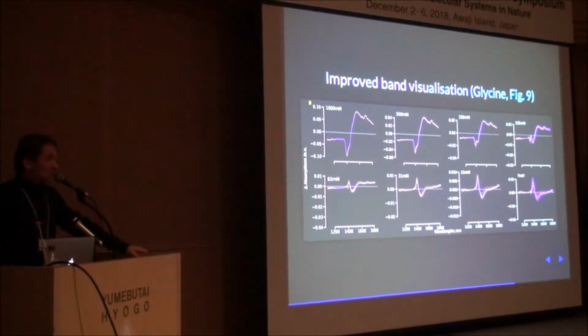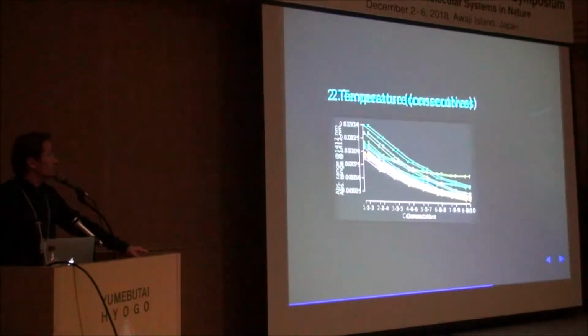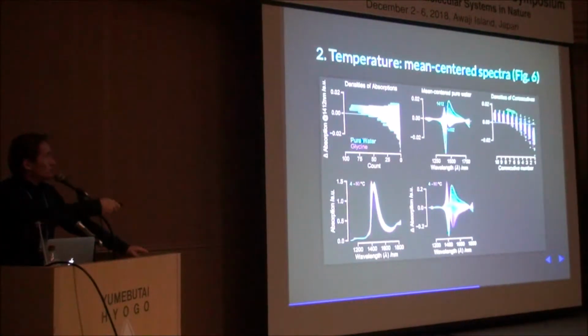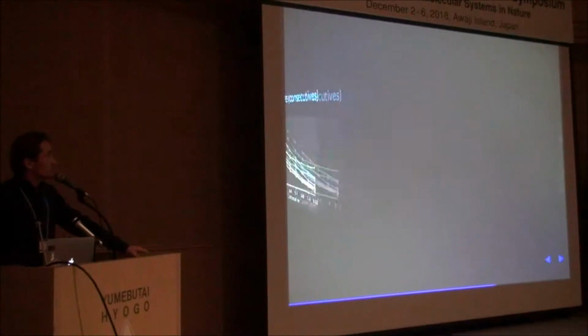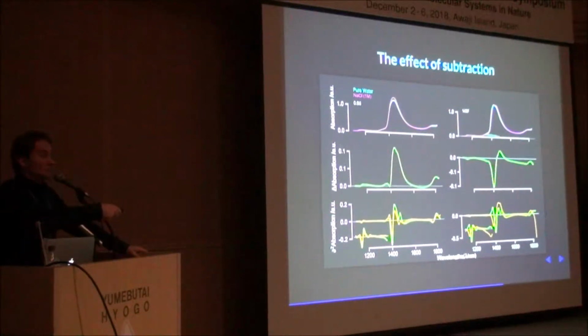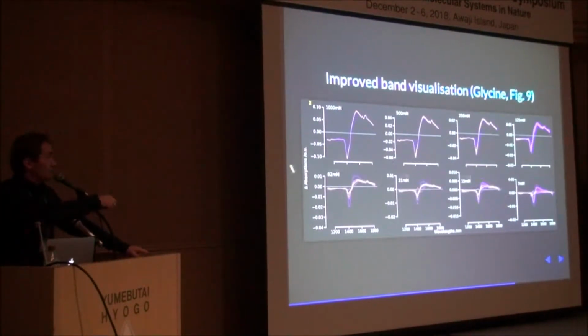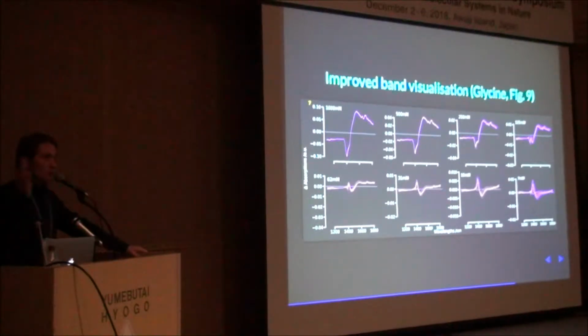And just like what happens here with these consecutives, what I showed you previously is that when you have consecutives, you're having the transition from cold to hot spectra. And here I'm showing you what that transition from hot to cold is doing to spectra. It is changing the outcome dramatically. And now I'm showing you, in this sample, in the real situation, how the spectra look when you go from cold to hot.